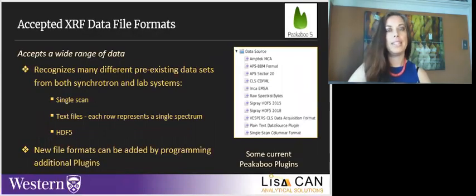If you can't get your data into the software, you'll never analyze it. Peakaboo is designed to read data in many formats from any XRF system, both synchrotron sources and lab instruments. Plugins are created to open the different file formats.